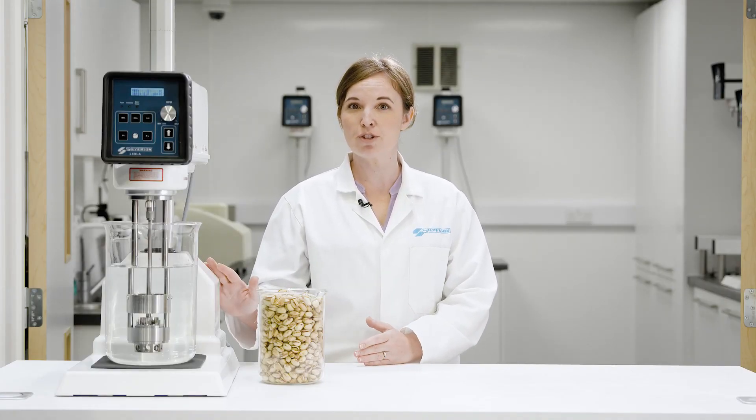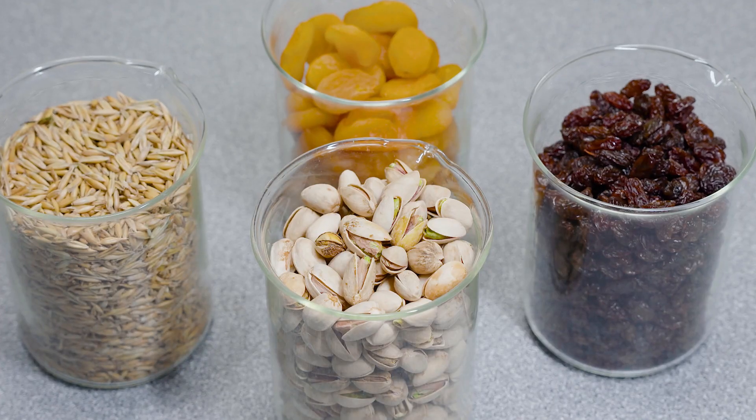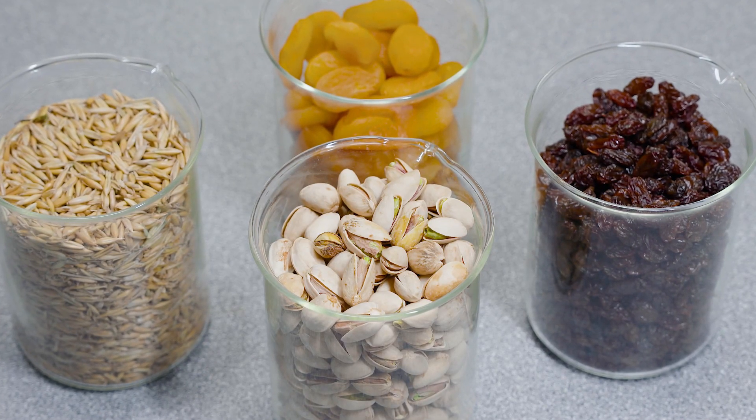In this video, we're going to demonstrate how Silverson mixers can be used in the preparation of samples for aflatoxin testing.